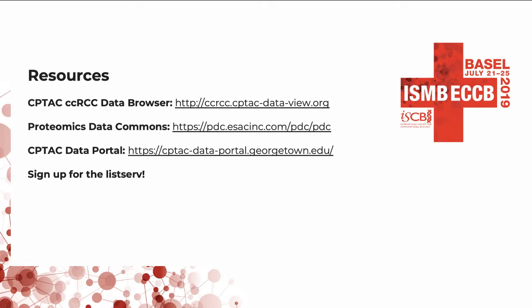Great presentation. So I just want to ask, all the data is available from this Proteomic Data Commons, the metadata. Is that metadata available through some API access? Yeah, so yes, Proteomic Data Commons has an API for the raw data, and then we are developing the next level API for the metadata. Okay, so the visualization portal sits on top of that. Exactly. Yeah, exactly.